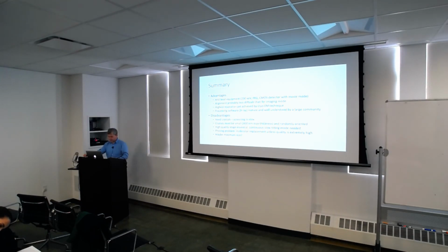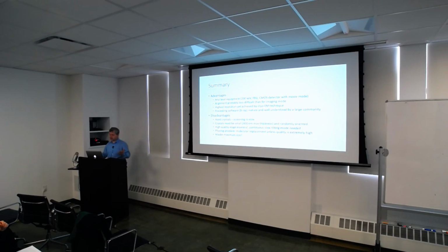But no, it hasn't been worked out yet. And then there might be a maximum size of the molecule too, but if it's big enough, maybe you don't have to worry about crystallography anymore. You just do a single particle. So this seems to me a technique that's good for small things that would be too small for single particle, or flexible things that you can coax into a certain configuration.